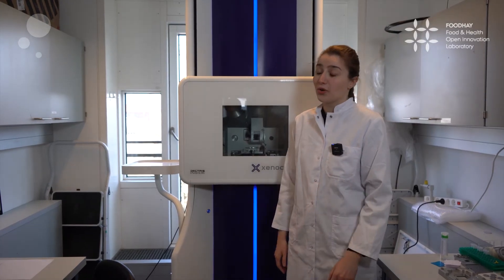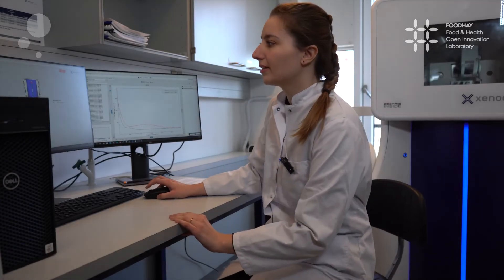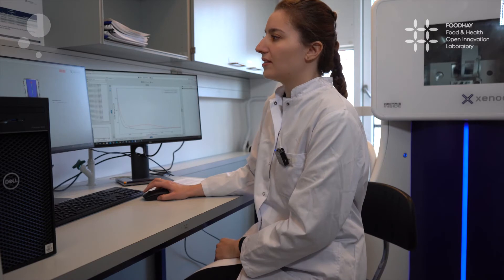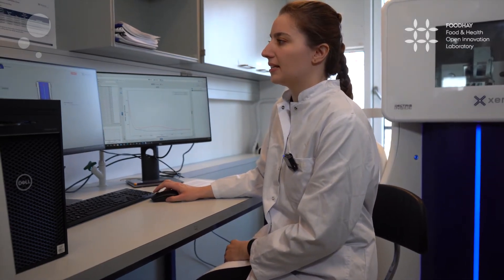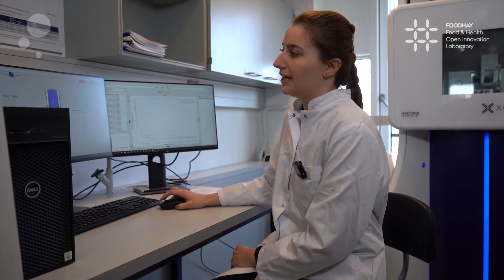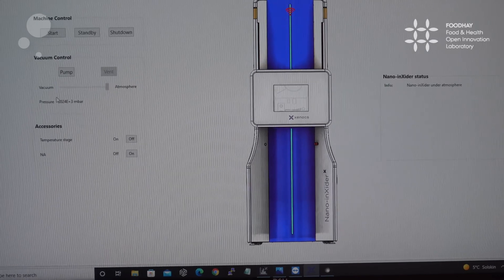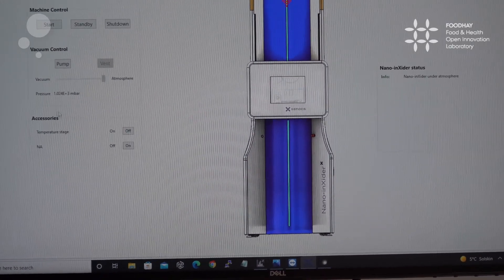Now I would like to move on and show you the software that controls the equipment. This is the NanoInxider control software — it is very user friendly for us to work with. Here at the first page you can see where we manage the machine control. We introduce the vacuum here, or we can vent the sample chamber, and once the vacuum has reached the required pressure, we can begin the measurement.